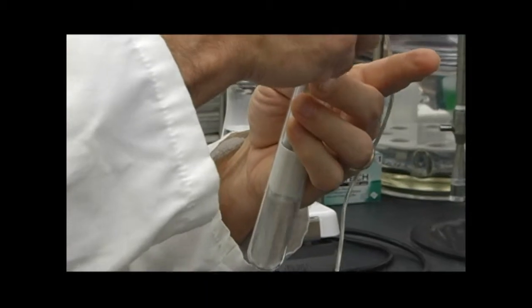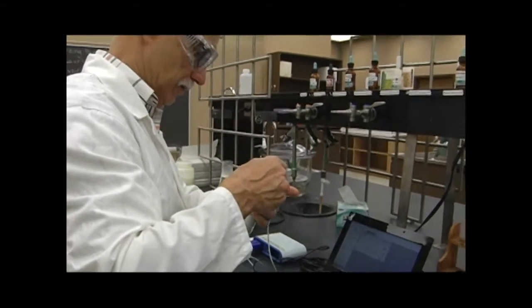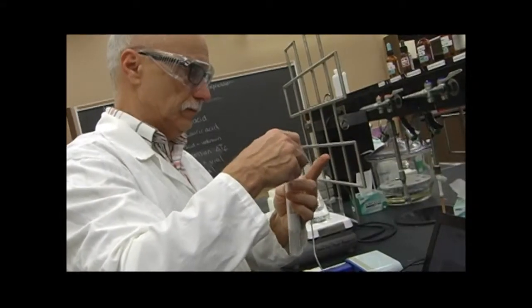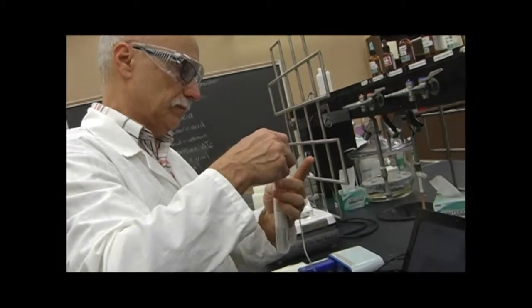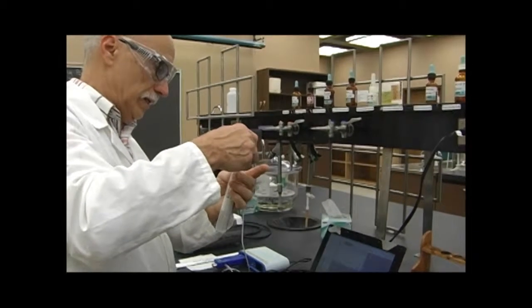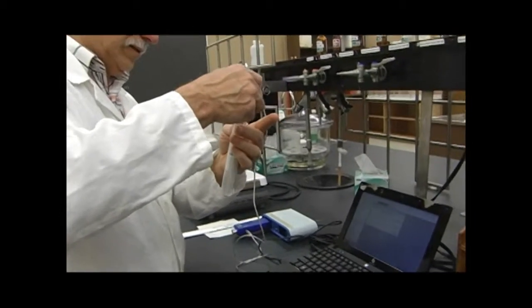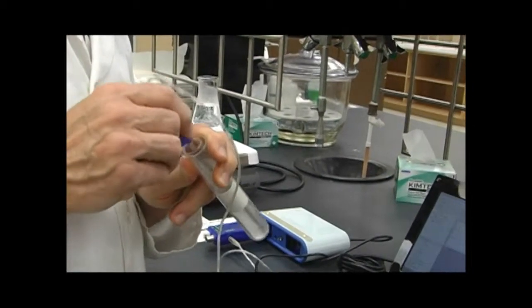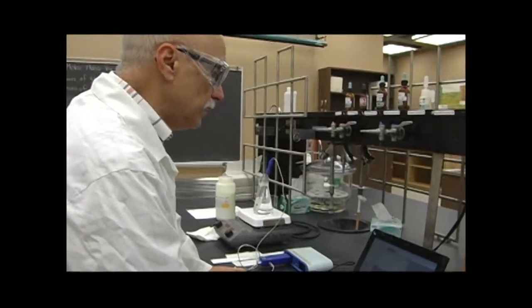That's the plateau. And it's 1 minute passed at that temperature, 36.9. 2 minutes. It's just gone down a bit at 36.8. So we've done this, this is the solution.